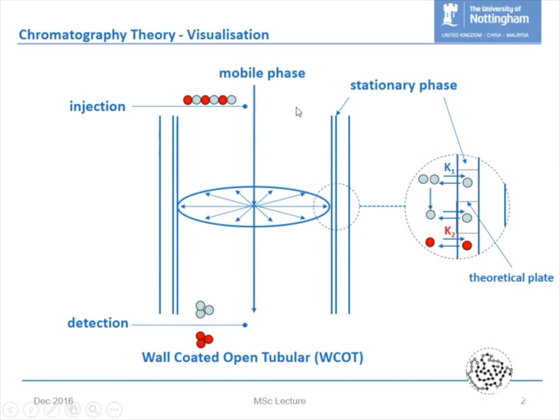Okay, now these principles are in every type of chromatography. And what we've got is a situation where we have longitudinal mass transfer, we've got radial mass transfer or diffusion, and we try and strike a balance between those two processes. Because if you consider it, we want our molecules to somehow get to the surface, to interact with the stationary phase, and it's only when you interact with the stationary phase can you hope to separate two molecules.